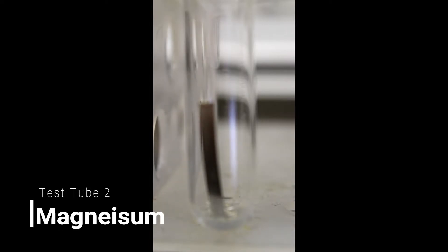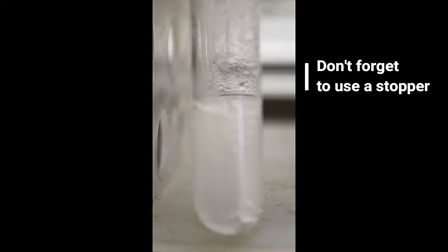Now we have our magnesium ribbon. Add our four milliliters of hydrochloric acid. Make sure we put on our stopper. Immediately we see a reaction occurring.